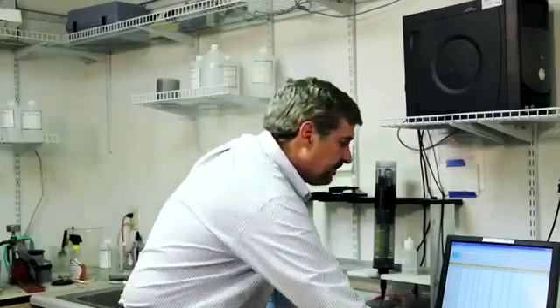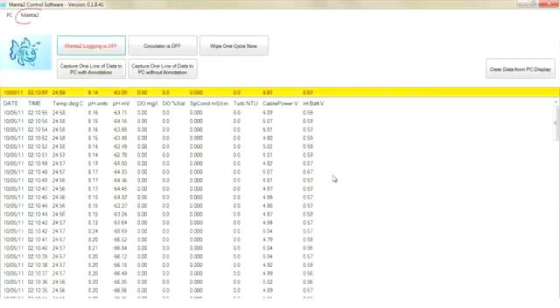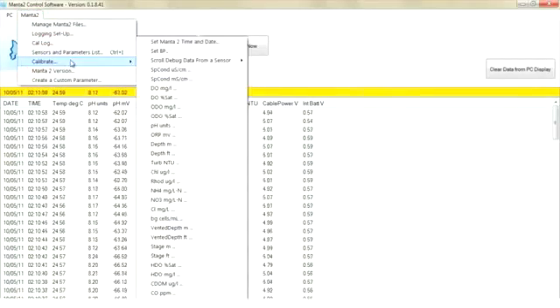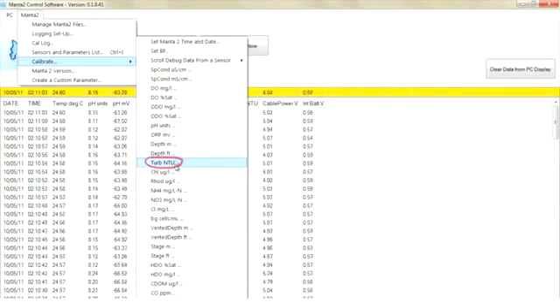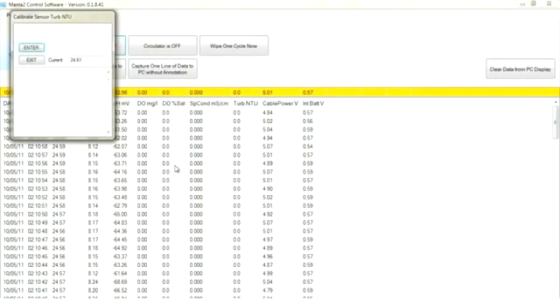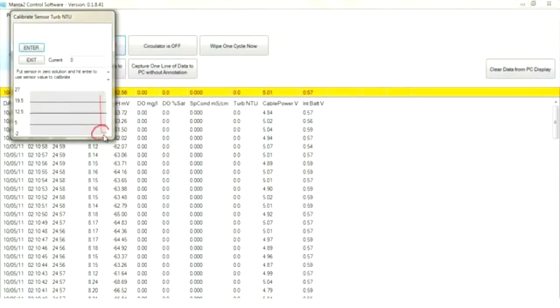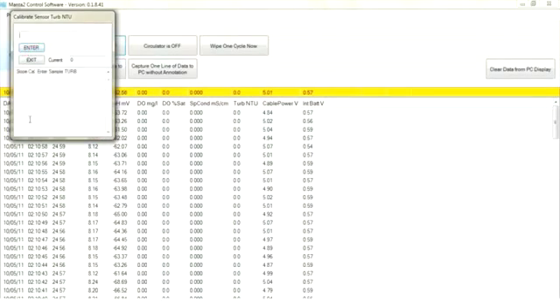And again, back to the screen. Manta 2. Calibrate. Turbidity NTUs. Very intuitive software. It says put sensor in zero solution, which is what we have it in. Hit enter to use sensor value to calibrate. Graph is stable. We hit enter. Now it says enter to slope cal.